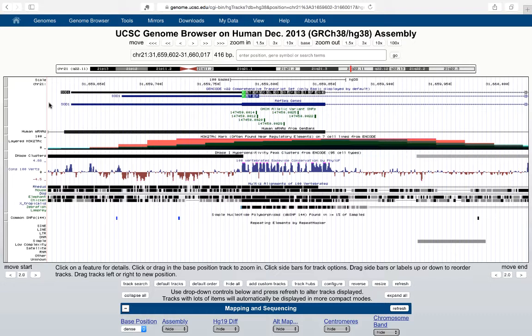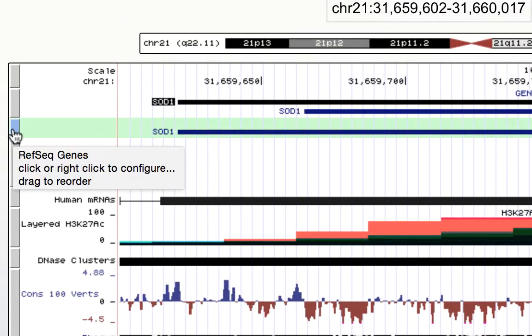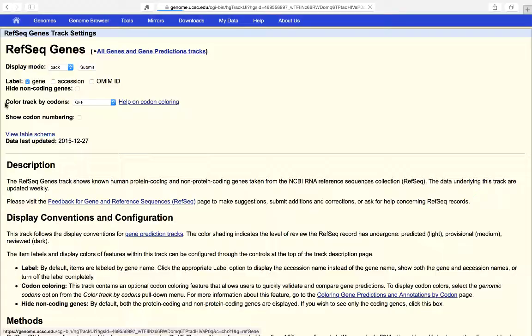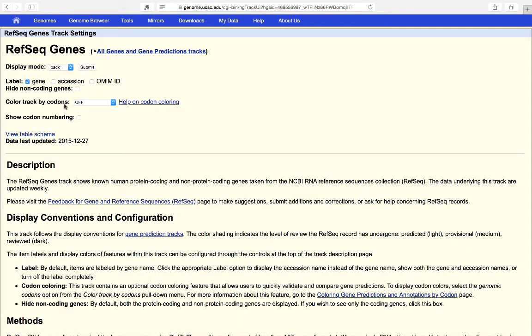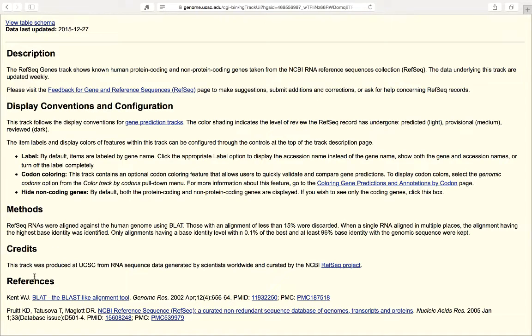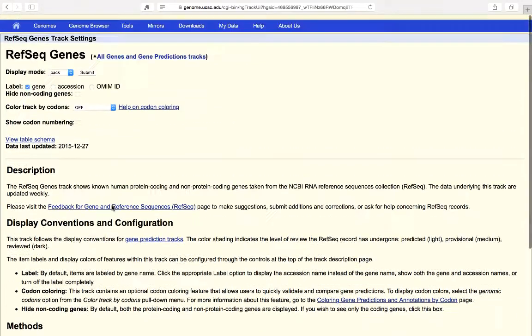We've already talked about the GenCode and RefSeq transcripts, and I just want to talk about the track click-through page. This is a sort of best-kept secret that a lot of people don't know about, even if they're regular users — if you want more information about a particular track, you can actually left-click on the left side of the screen and it'll take you through to a page that gives you more information about that annotation. It allows you to set some features of that track, turn on and off numbering, and it'll give you more descriptions and some references so you understand how the track was compiled, where the data came from, and you can link out to related databases and publications. This is a useful feature to know if you want to understand any track in more depth.